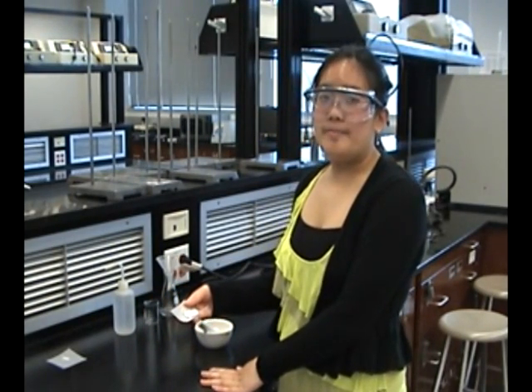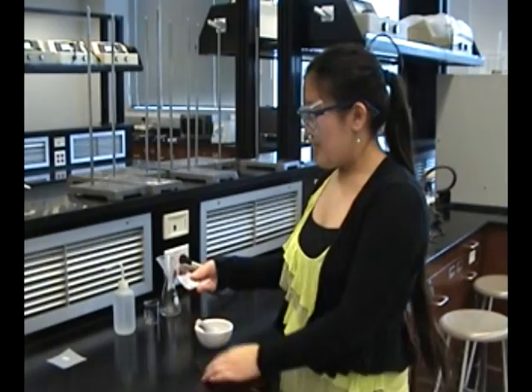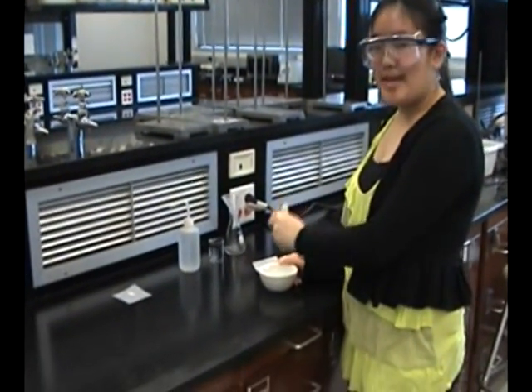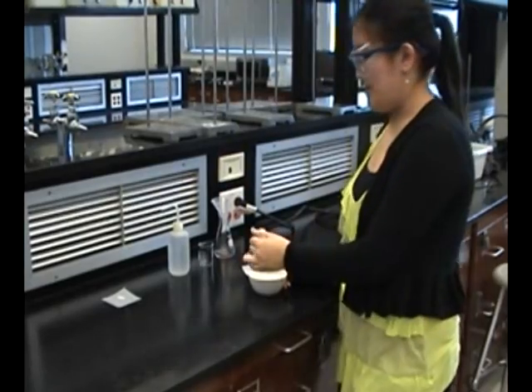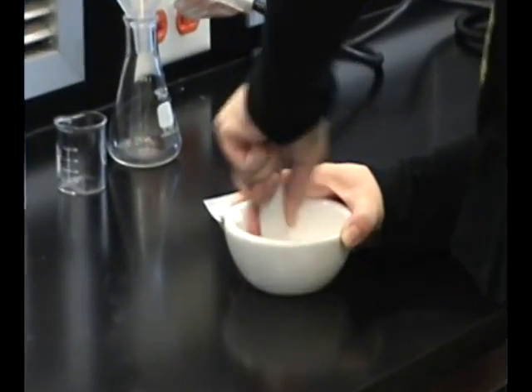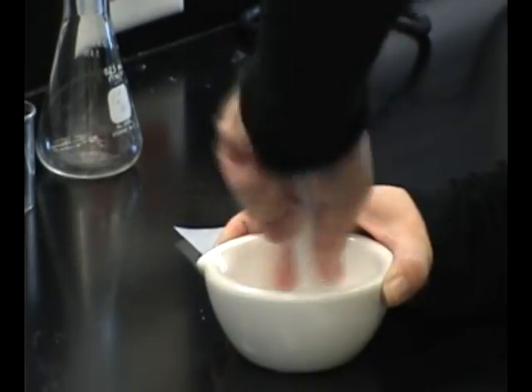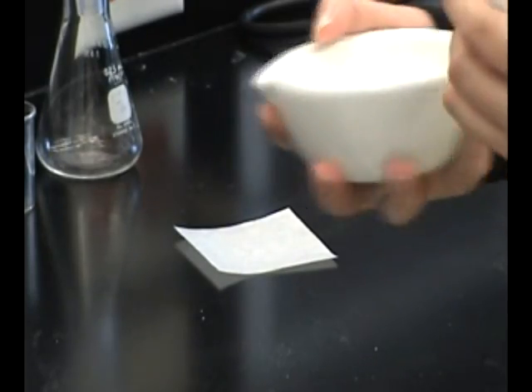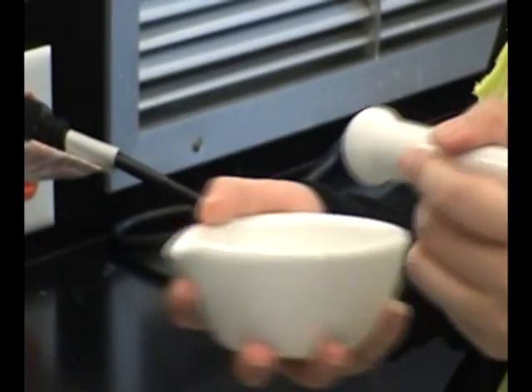First, let's isolate acetaminophen. You should have already obtained six 500mg Tylenol tablets. Transfer these tablets into a mortar. In this step, you're going to grind these tablets into a fine powder. Instead of pounding these tablets, you're going to pulverize them in a circular motion. Then once in a while, shake the mortar gently. This will force larger particles of solids to go to the surface. Then continue grinding to a fine powder.